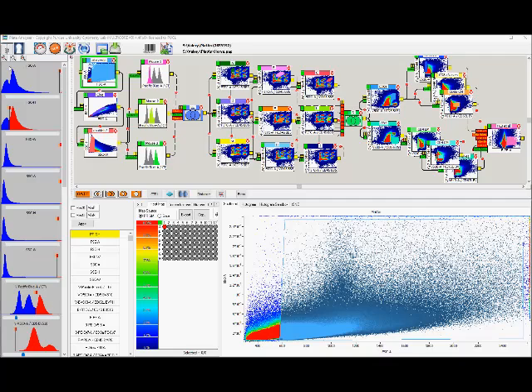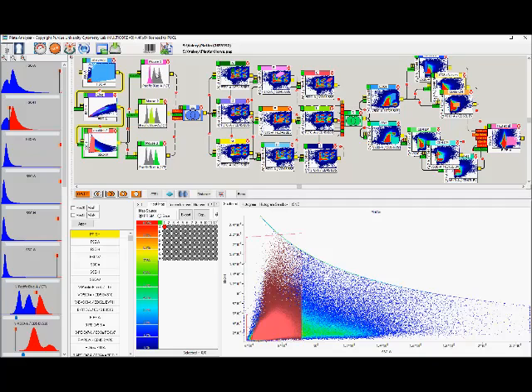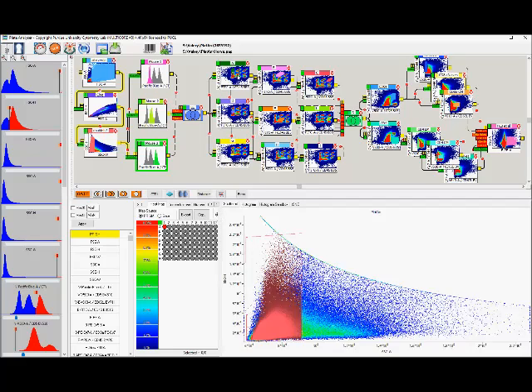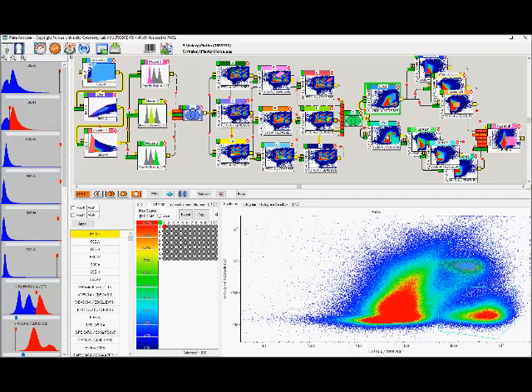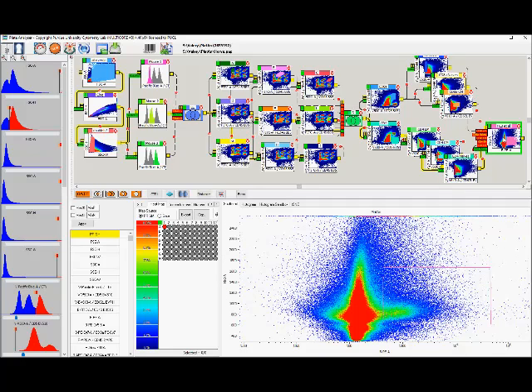Okay, this is running through the parameters that we've set up. This is a logic map. Here, if you right-click on each of these, down on the bottom right-hand side, you'll see each of the histograms. So here's mouse 1, this is mouse 2, this is mouse 3. And then here are the various regions that are your barcodes. And then here are your CD8s, here are your CD4s, and then here are each of the sub-regions that you've identified, and then over here is a combination of your FCBs.